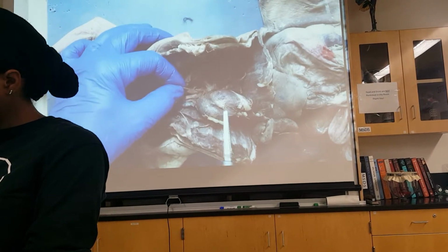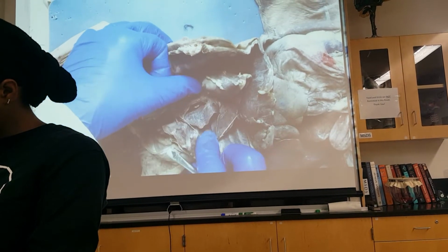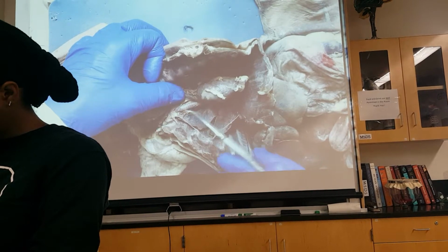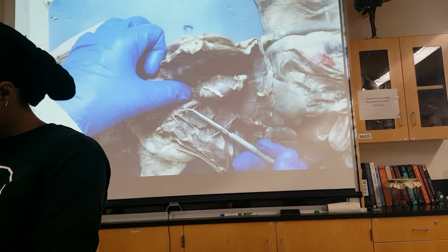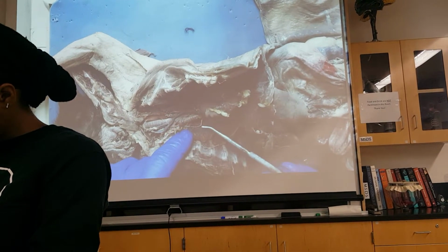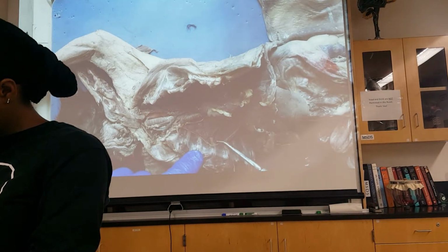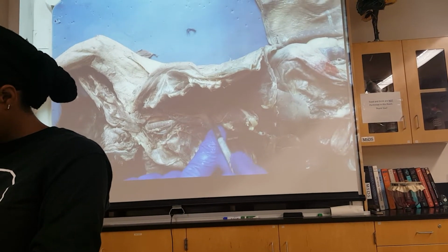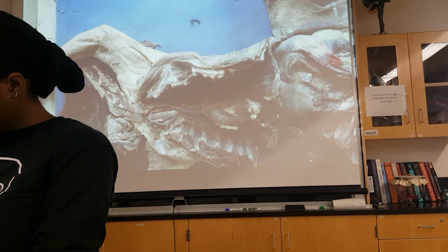So that's the left vagus. The right vagus is found over here. Under the superior vena cava is the rest of the trachea, because we could see the trachea up here. And alongside the trachea then is a thick nerve here. And that is the vagus nerve on the right-hand side. We've got a phrenic and a vagus on the right, and we've got a phrenic and a vagus on the left. And then we have all those posterior intercostal nerves.